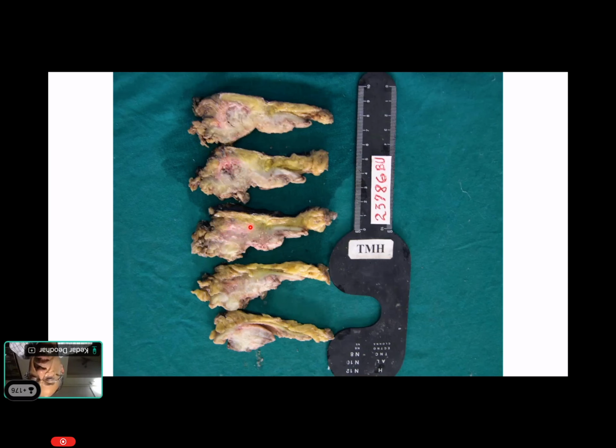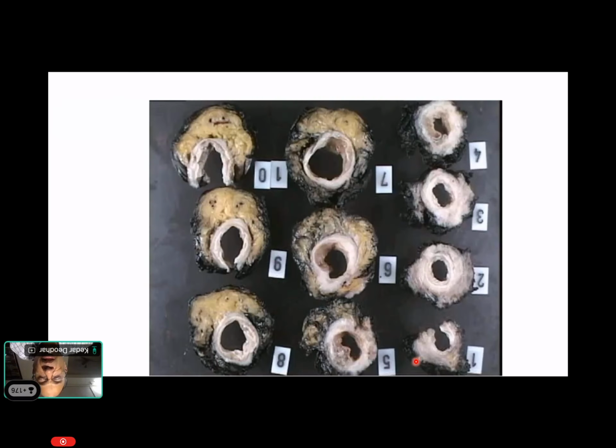These are the slices, and we are looking at the deepest area, maybe this area which is deepest, but I can see here there's a whitish node in the perirectal fat. So this is what I want to take. This particular section, if I can take it completely from the main tumor, I will take it. If it doesn't fit in the entire cassette, I will take this section, but I will keep this black ink on the external aspect intact, because if this node is positive histologically and this black ink is less than a millimeter away, then we have to call the circumferential resection margin positive.